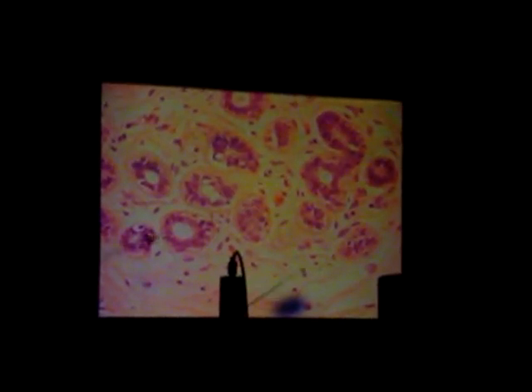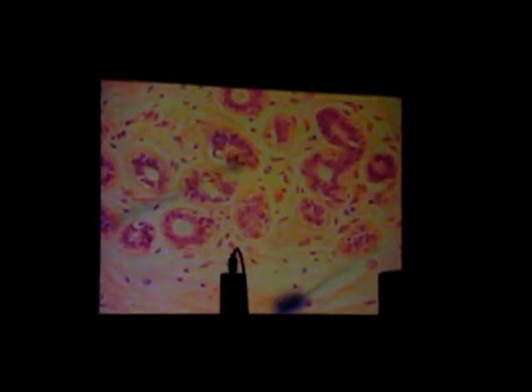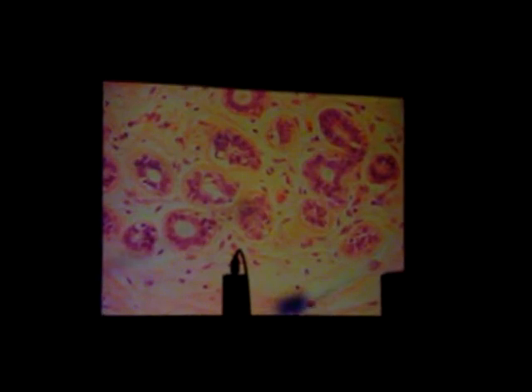The power I'll go will be high. So that's what you'll see test day right there. Name the structure: secretory tubule. Name the organ it came from: breast, mammary gland. And what phase? Inactive mammary gland.